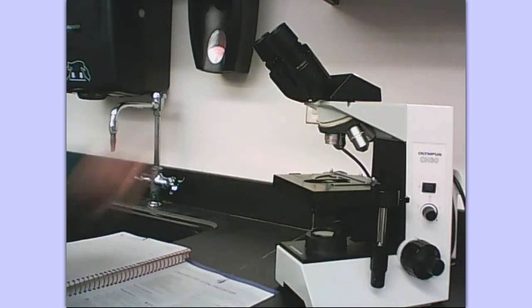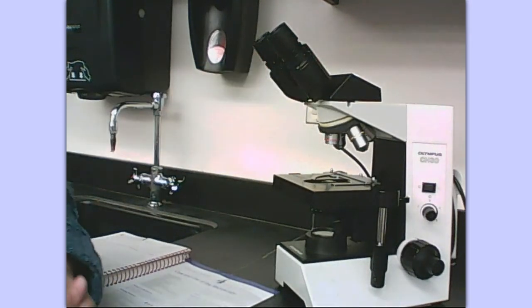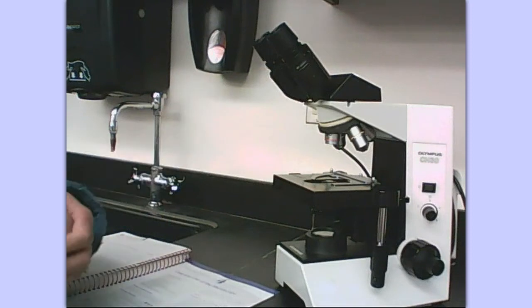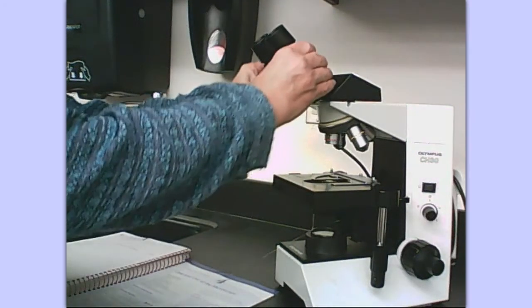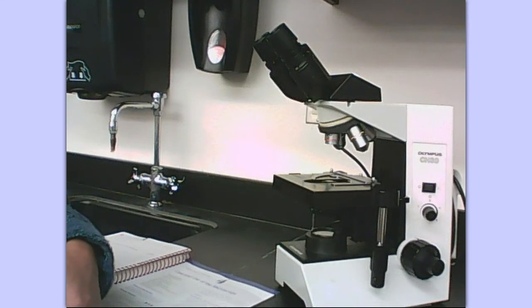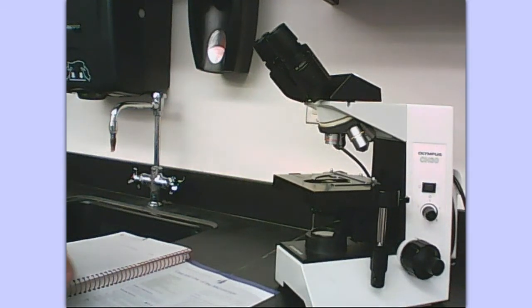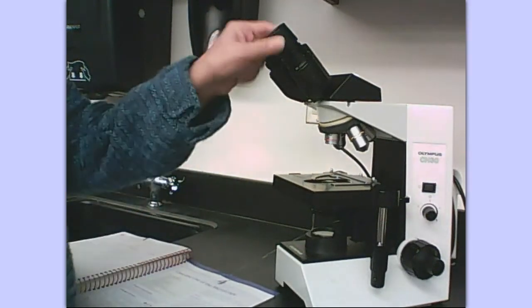Let's go over the parts. You have two eyepieces here, also called oculars. They work together and you're seeing in stereoscope as you're looking through those two oculars or eyepieces. One eyepiece is going to have a pointer in it and the other one isn't. These are adjustable since we all have a little bit different distances between our eyes, so the oculars are adjustable so that we get them just right for us.